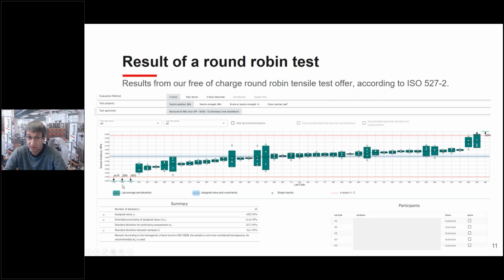So I guess that in this case, they just missed the decimal point by 2 digits. So it's a very simple mistake, but that can happen, and if it were a real test, then this lab would deliver totally wrong values, which can cause really strong impacts.